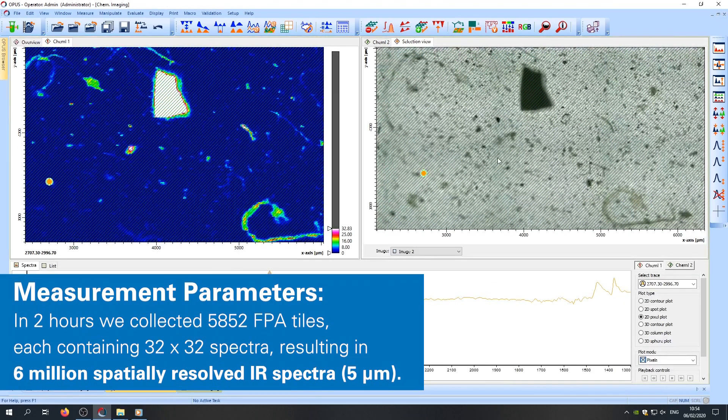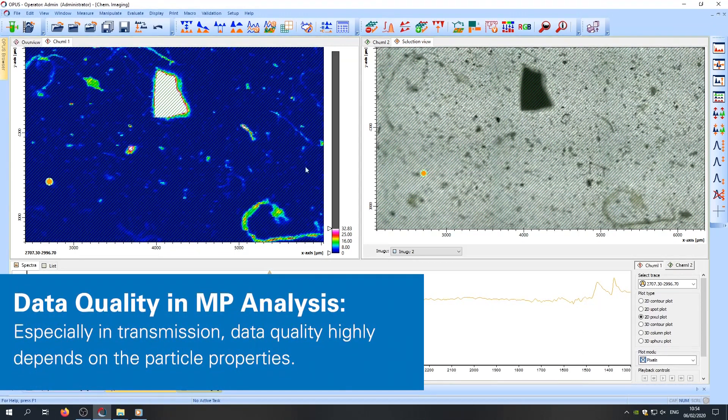What is impressive in this case is that we only measured with one scan acquisition and still have a very good spectral quality that we can find small particles and uniquely identify them performing a library search.